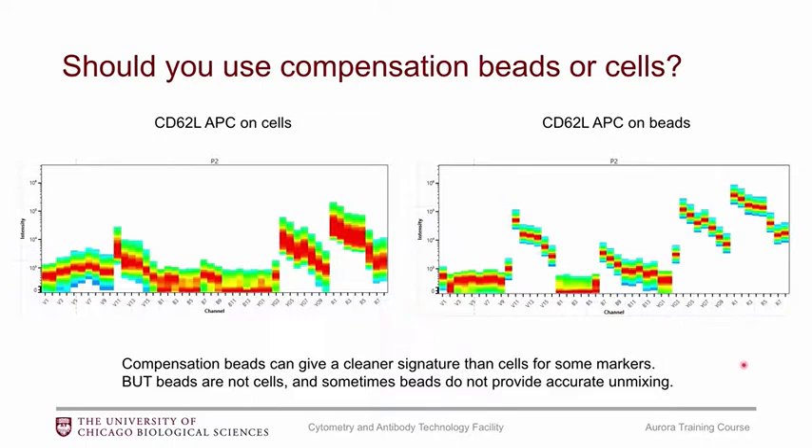Now for the big debate: should you use compensation beads or cells? Here are two examples of the same APC antibody — one stained on cells and one on beads. The beads make a cleaner signature with narrower histogram peaks and a brighter signal. However, the problem is that beads are not cells, and it's been found that using only compensation beads can produce some inaccurate unmixing.